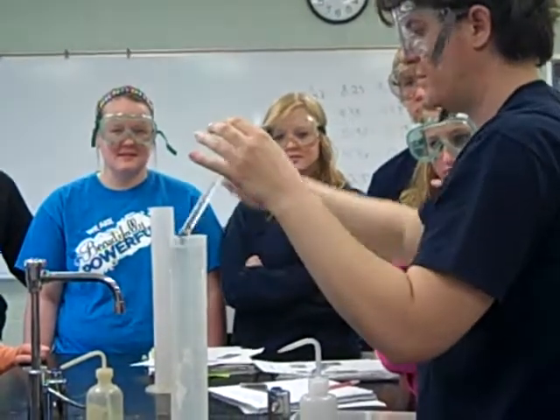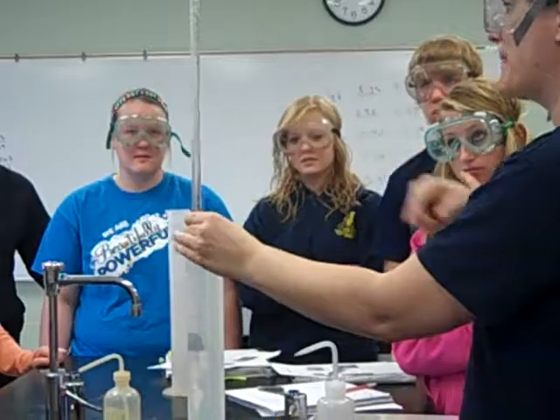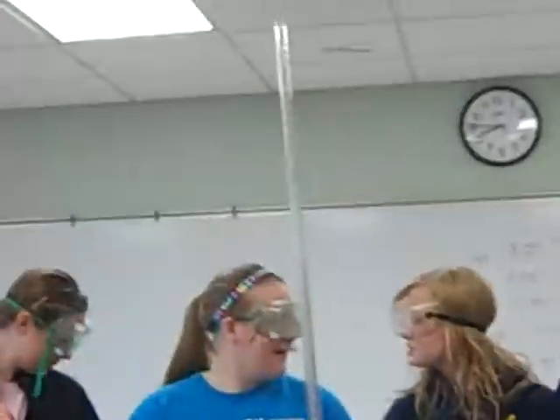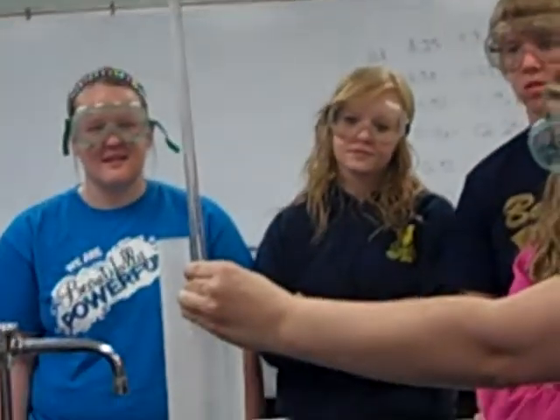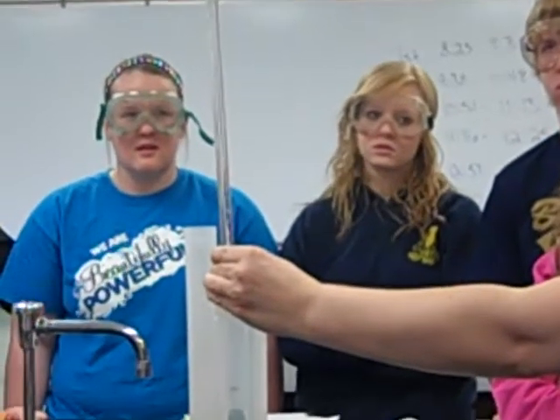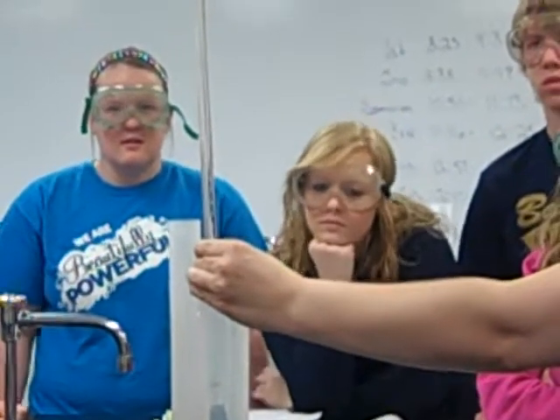And then we're just going to tip it over. What's going to happen? That's pretty neat. So what we're looking at is that density difference — the acid is heavier, so it's going to sink down to the bottom where our magnesium happens to be. So right now we're just waiting for it.